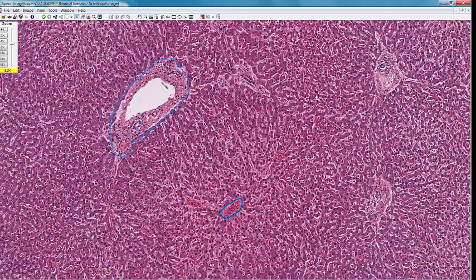Here is the portal vein. Here is the arteriole. Here is the bile duct. Remember from the drawing that the hepatocytes which surround the portal tract are called the limiting plate. I am outlining the limiting plate right now.